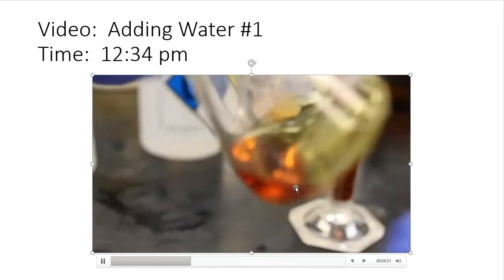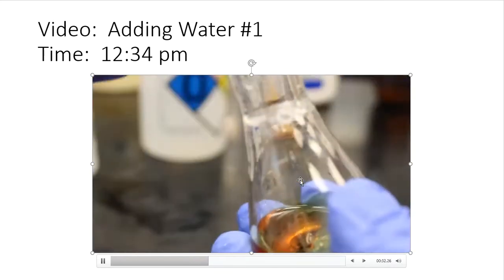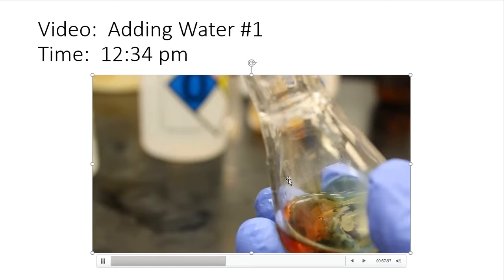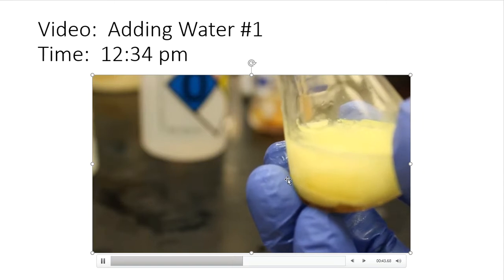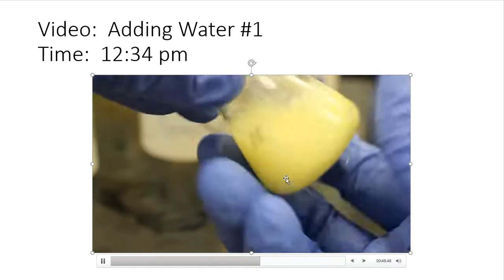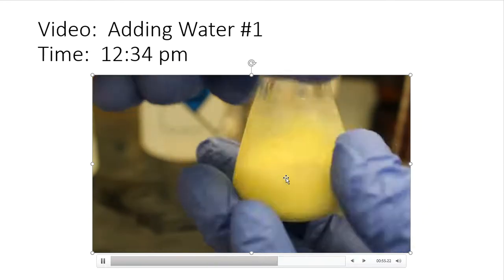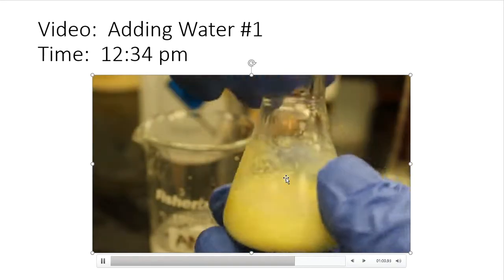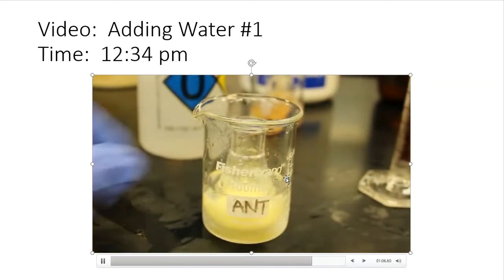So acetanilide product right here. That is what I ended up with. And now we're getting ready to add water. What happens? And there you go. I think it's very obvious what kind of observational changes you could make. Notice these colors, they're all orange and reddish and brown and burnt. This is pretty normal for nitrating reactions.